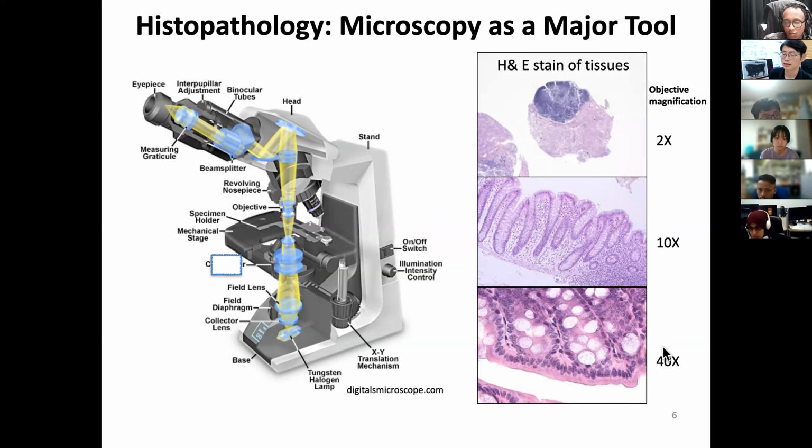And remember that at about 40x you can typically watch the sample without immersion oil or water, so it's much easier. If it's 40x, you can see the cell nucleus more clearly. And these are, I guess, mucin-producing goblet cells. At 10x, you can see cells somehow. 20x is very good, a typical high resolution microscope, and 40x.